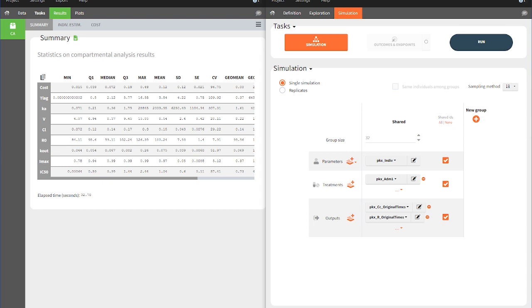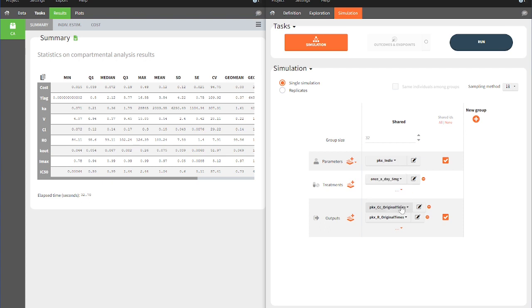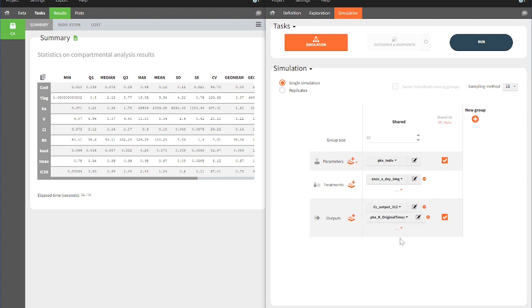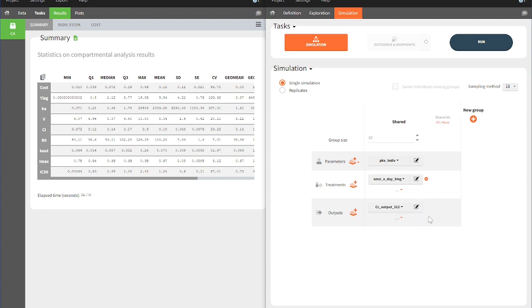We choose as treatment element the element we created before in the Definition tab, analogously with the Output element. We remove the response from the simulation, since we did not create a corresponding response output vector.